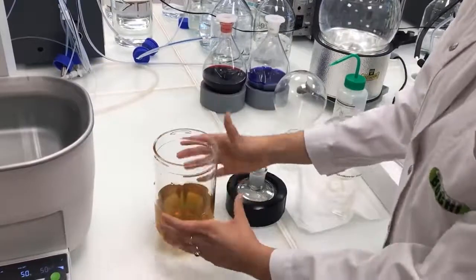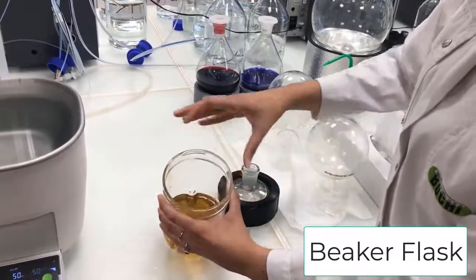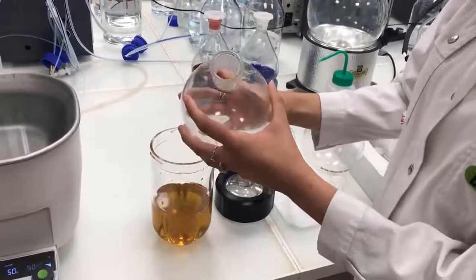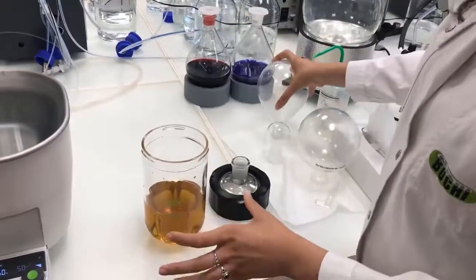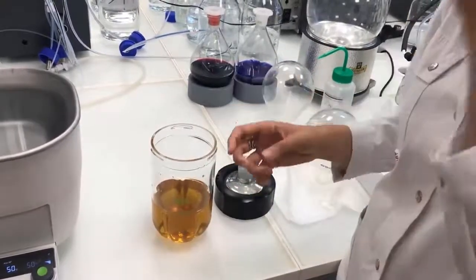And as you can notice here, we have what we call a beaker flask. So what's a beaker flask? The beaker flask actually has a much bigger opening, as you can see here, compared to a normal evaporating flask. As you can see, it's much smaller here. So what's the benefit of the beaker flask, especially in the mixology and food applications?